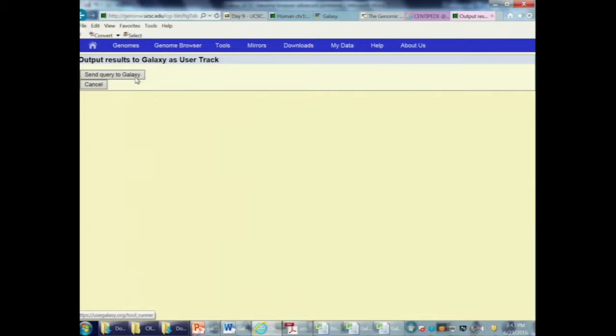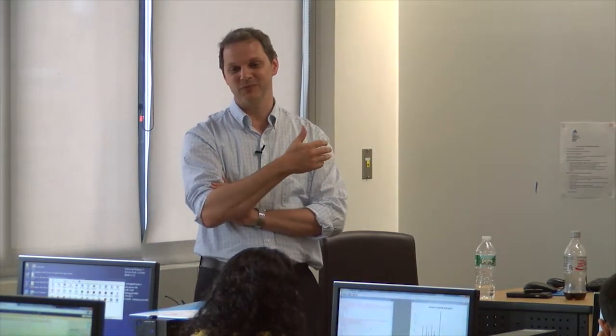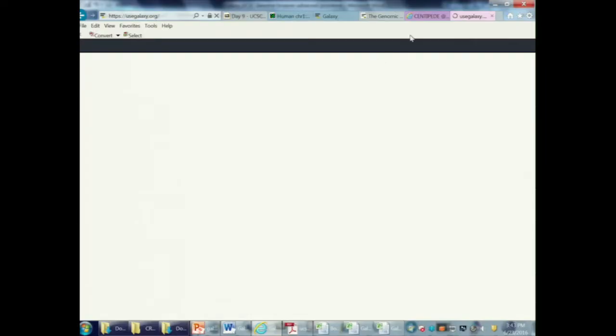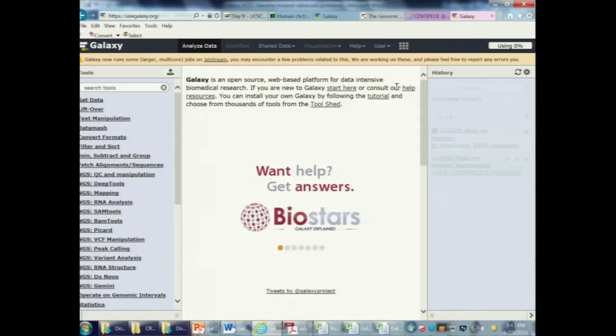We were having some of these conversations earlier with Brian, like, okay, if you want to define transcription factor binding sites, how do you want to do that? We could use ENCODE data. That's done by ChIP-seq in 138 different cell lines, looking at, I don't even know, 88 different transcription factors. This particular one I like a lot. The nice thing about this particular data set, if we just send it to Galaxy, I'll show you, is that it defines a specific motif.